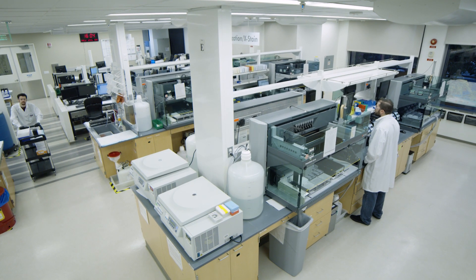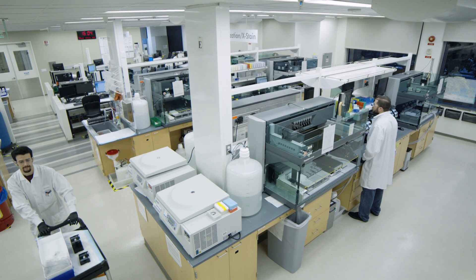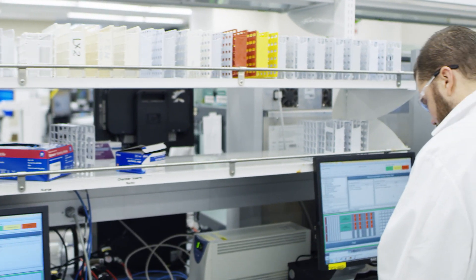Thanks to its robustness, minimal hands-on time, and automation scalability, our own Services Lab and Customer Labs can process millions of samples every year. Let's get started.